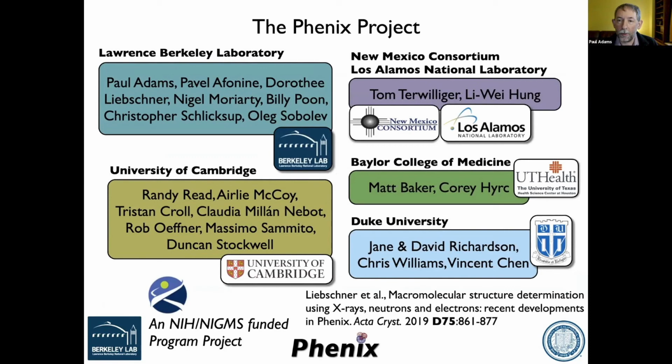So just inherently, refining against low resolution using the target we use in phenix.real_space_refine is going to, by definition, try to crank up your clash score. So if you start out with a nice model, it's totally valid to increase the weight up to the point where you see meaningful geometry. That's just dictated by the target function we use.